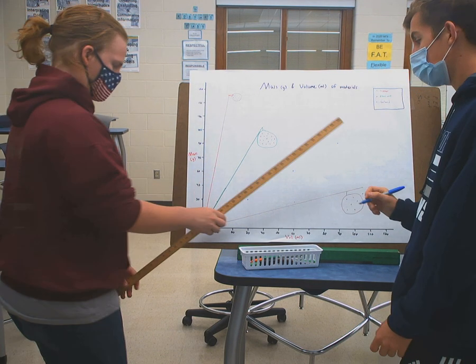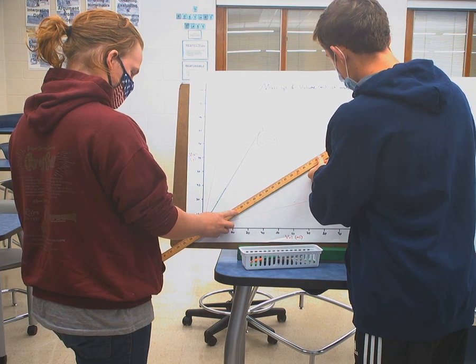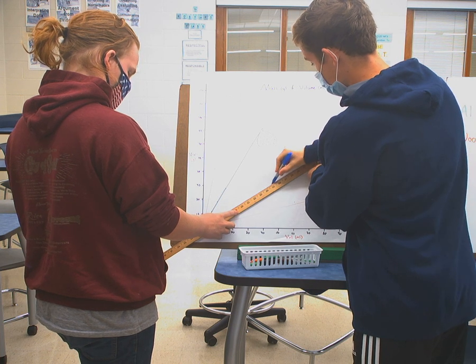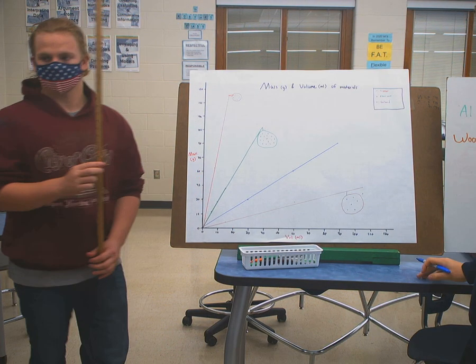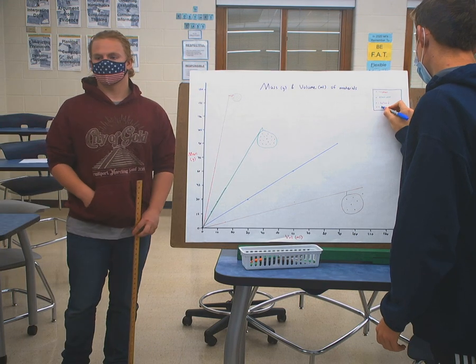So can we actually do that while it's tilted in the holder there? Good. Oh, and we're going to be so lucky. Let's go ahead and add in the legend. Do you have a little spot? Add a little blue dot and put H2O or spell water, whatever you prefer.